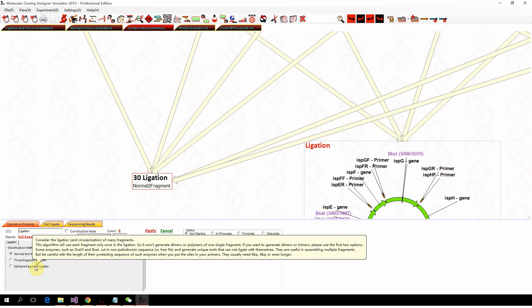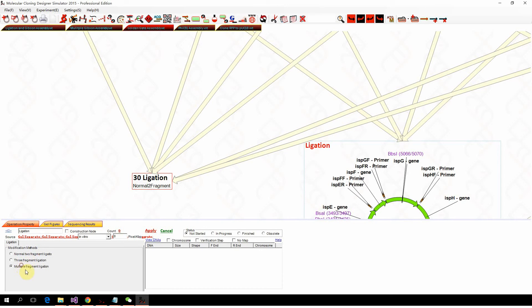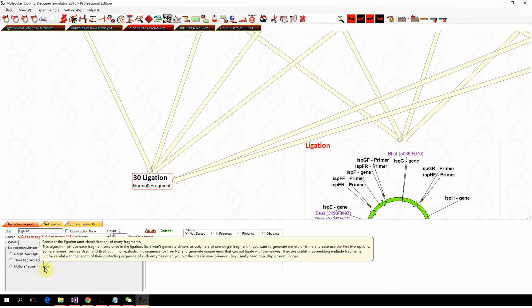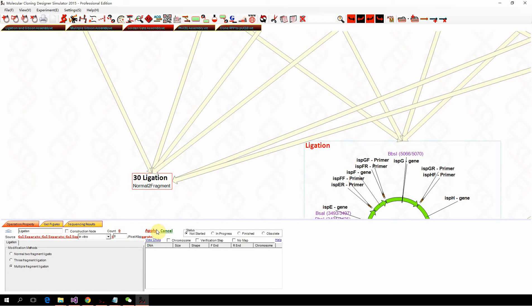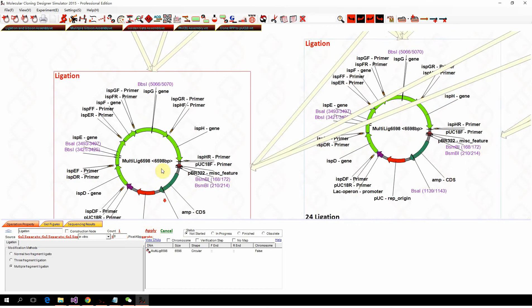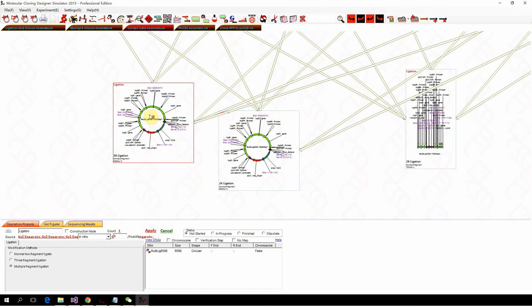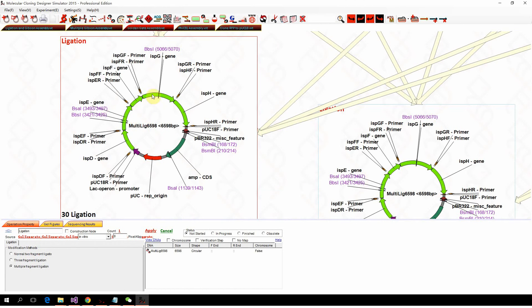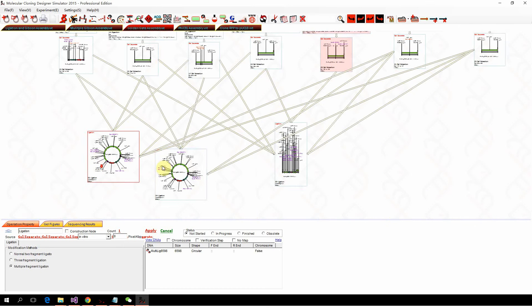Be careful, if you want to perform multiple fragment ligation, especially the Golden Gate, you need the multiple fragment ligation mode, and then click apply. You will get six fragments ligated into the plasmid.